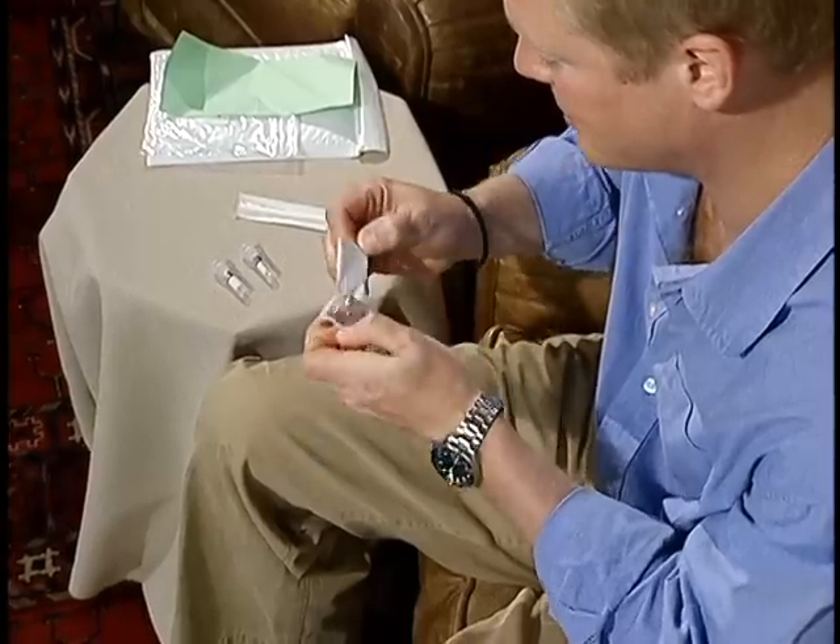you'll find two swabs with your package. With clean hands, carefully open the plastic wrapper, being careful not to damage the scraper tip.